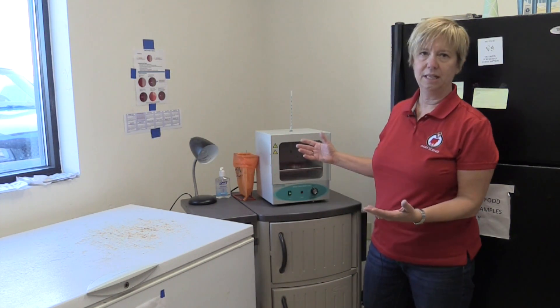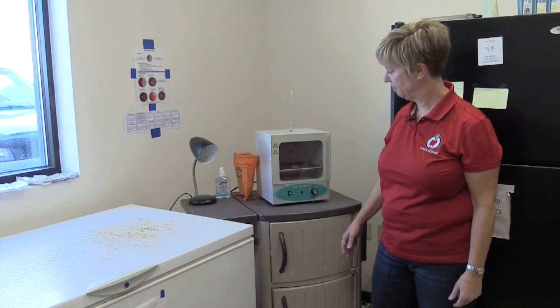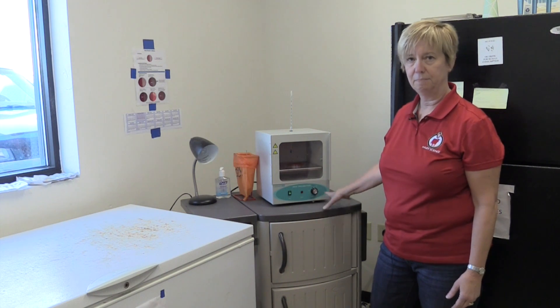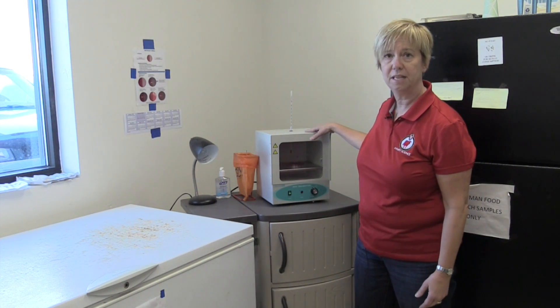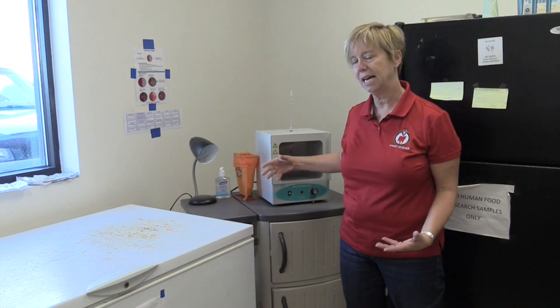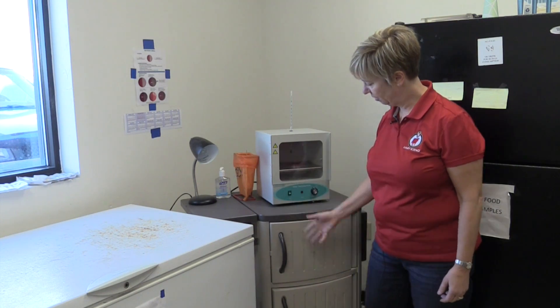The area we're in right now is a small work area that meets all of those criteria. For this particular on-farm laboratory we've set up a small portable plastic cabinet area. It's easy to disinfect, it's got sufficient workspace for our incubator, we've got a task light available so we can turn it on and easily look at the colonies, and we've got an area where we can store our supplies.